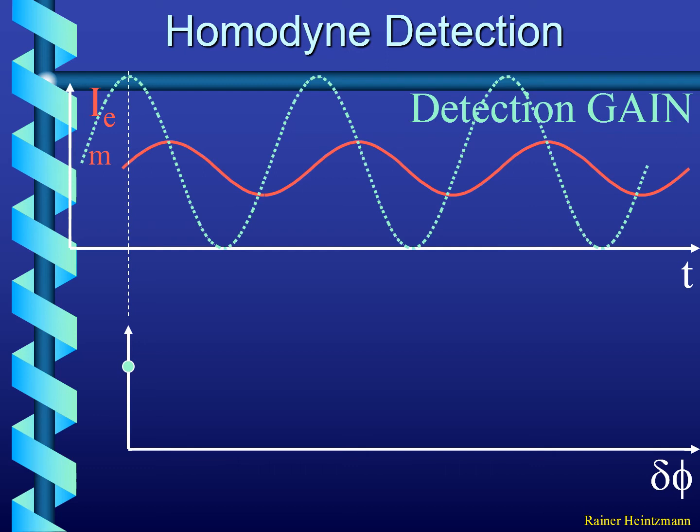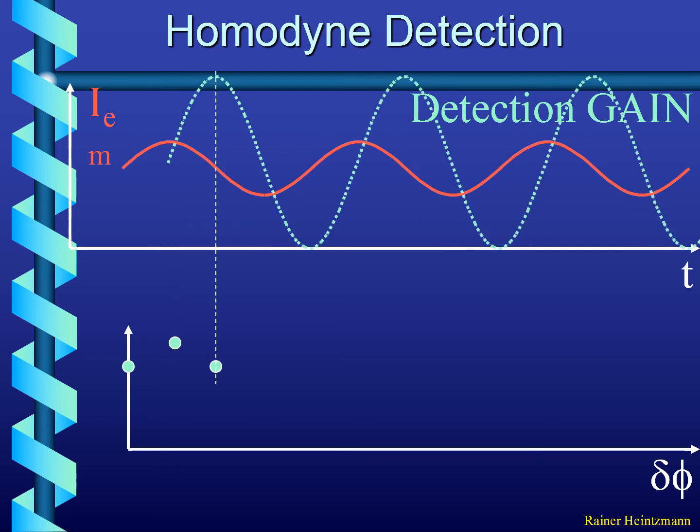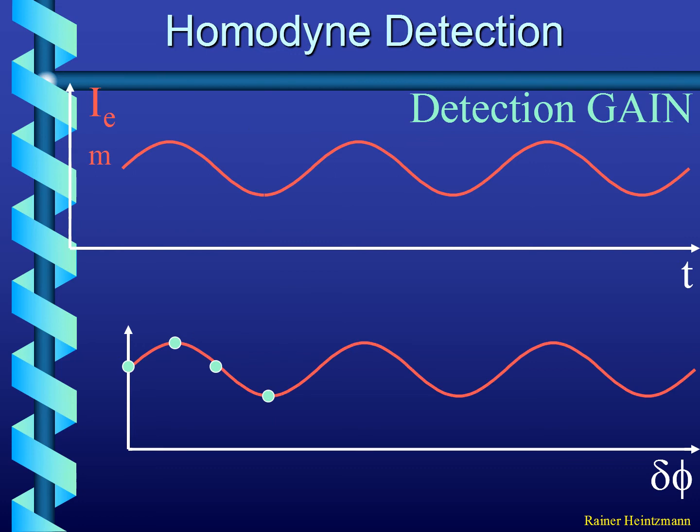That's the curve of emission over time now, but that's not what we measure. We then have this detector gain, which gets multiplied with it, right? So we are sending the same original curve to the detector, and it would multiply the curve like this. If you now calculate the integral of this multiplication, you get a certain value here. Then we are phase shifting the detector gain, and what you now see is we get a measurement that looks like this. This measurement essentially reproduces this curve, except that it is still down-modulated a little bit by this second integration with the sine curve.